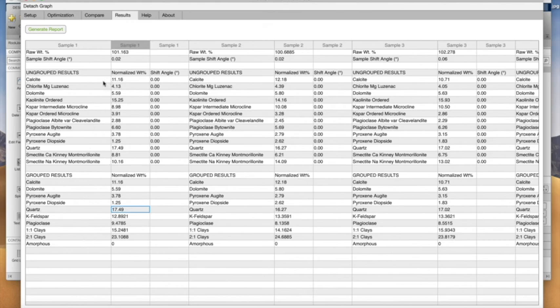Sometimes it's hard to tell apart the chlorite as well. But if we split them apart, we have about 19% smectite and 4% chlorite. In actuality, the mixture had 20% smectite as opposed to 19, and 5% chlorite as opposed to 4.1. So both of those are really close.